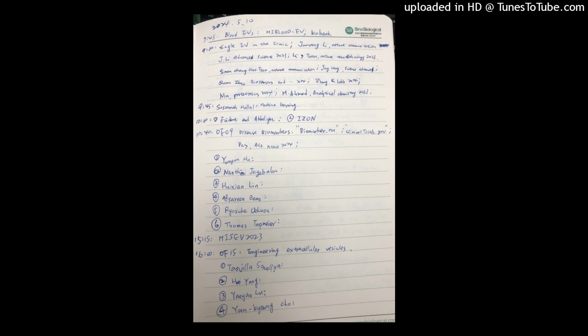Yeah. Well, actually, if you have biobank samples and you thaw them, supposing you're the first to thaw them, not samples that have been already frozen 10 times, most of the platelets do not fragment. So let's say 10 or 20% of the platelets will fragment. So if you thaw the samples that you get from a biobank, it's still very easy with the flow cytometer. You don't even have to label the platelets. You can very easily quantify the platelet contamination.